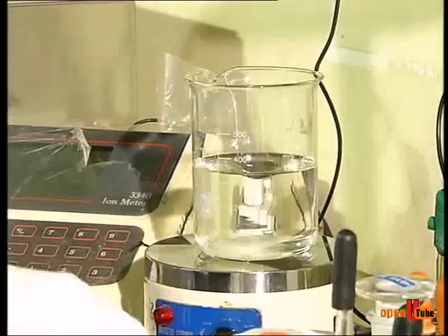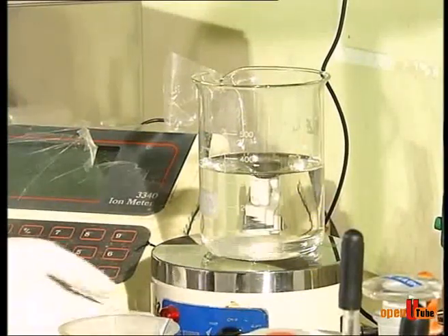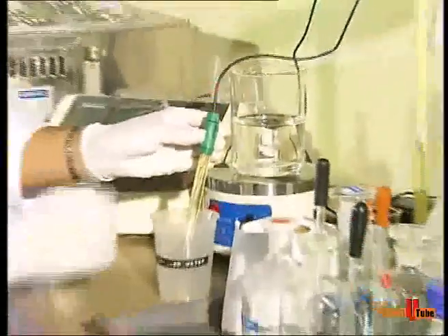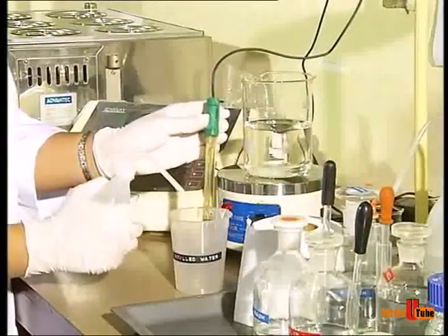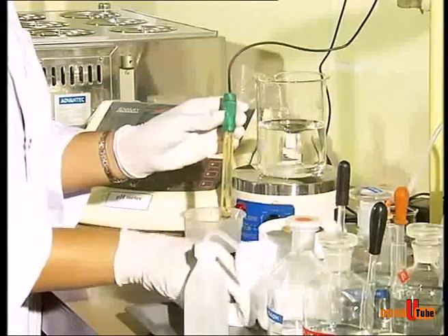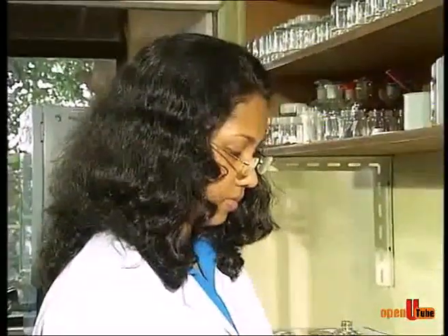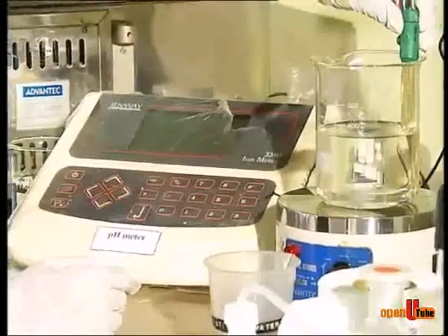Before measuring the pH, it is important to wash the probe of the electrode with distilled water and wipe it with a clean tissue. Then you can measure the pH of the solution. If the pH of the solution is greater than 5.8, it is necessary to adjust the pH by adding 0.1 M hydrochloric acid. If the pH is less than 5.8, we should add 0.1 M sodium hydroxide to adjust the pH.